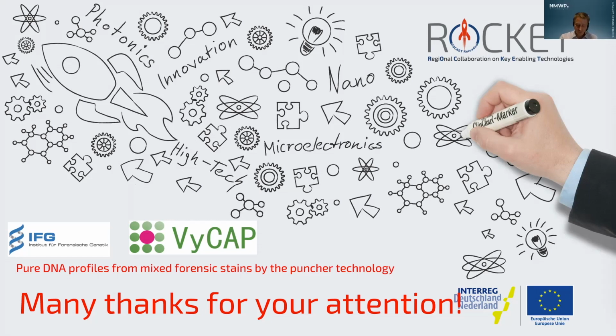Okay, but I think if you, for example, combine fluorescence, photonics with artificial intelligence, you could say in the end, okay, we are absolutely clear that no females were involved, for example. So you can say, okay, please system, please extract just male cells. The other ones are not interesting, or we're searching for blood cells or other cells. So if you can give your machine a certain kind of briefing, so it's okay, please differentiate, then in this case the automation would do a lot of work that has to be done by hand now.